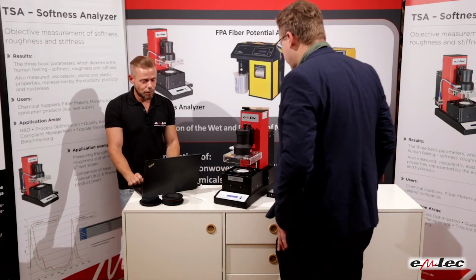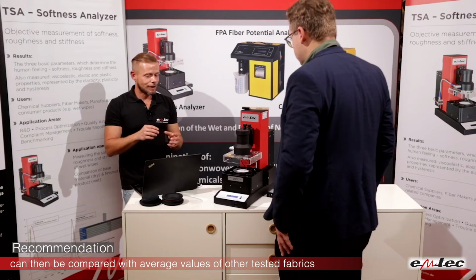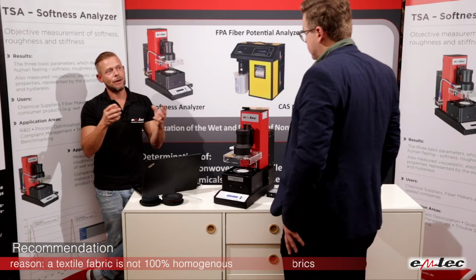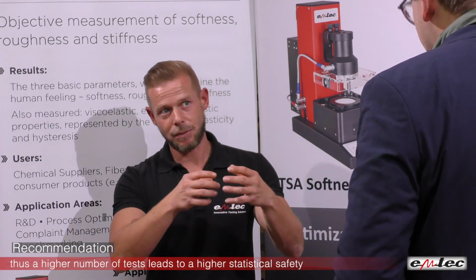I think also important with regards to the sample to mention is that we should do 5 to 8 repetition measurements. So one is not enough, and you always need to take a different piece. It's also nice because you get an idea of how homogeneous your product is, but it also gives you a higher statistical safety to compare average values with average values. Yeah. So I think this is important.